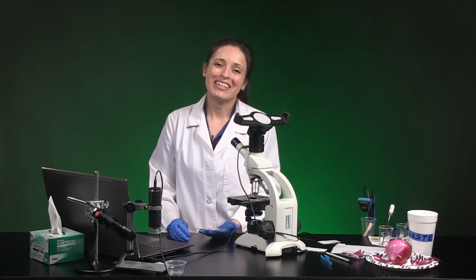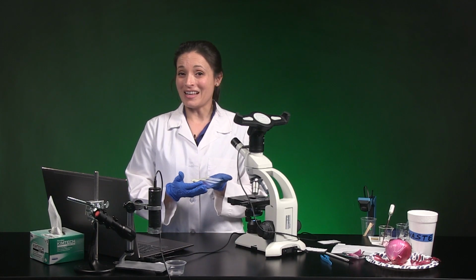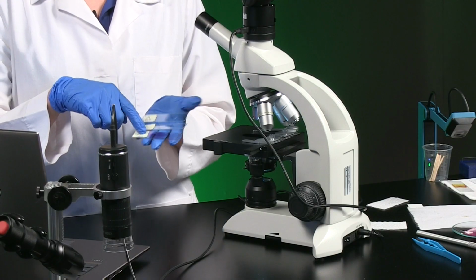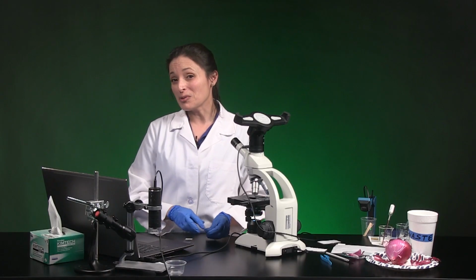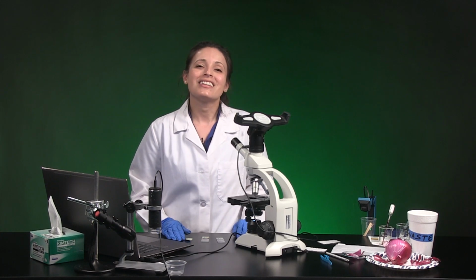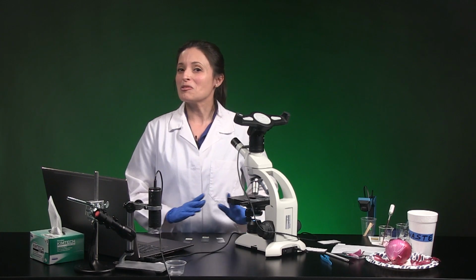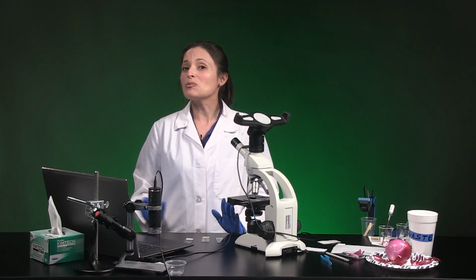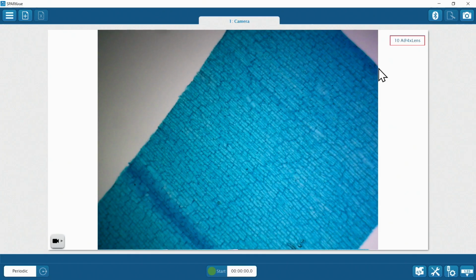Now for the challenge. I'm going to share 3 more slides, slide A, slide B, and slide C. You have to look for clues to figure out whether each shows plant cells or animal cells. There's a row for labeled images and observations for each slide in Table 1. All the slides will show up in your sample data file. I've renamed each image to match the letter and objective lens I used.